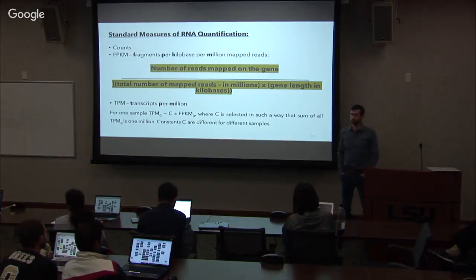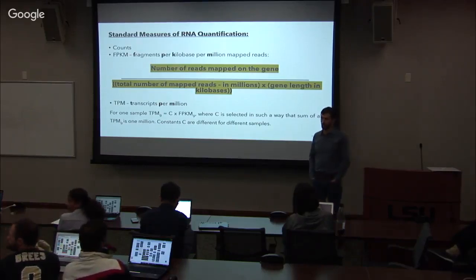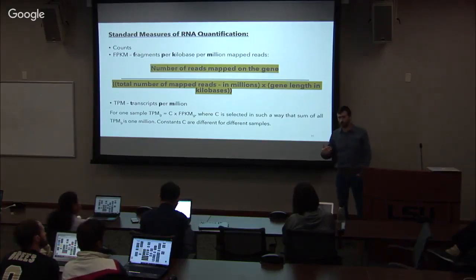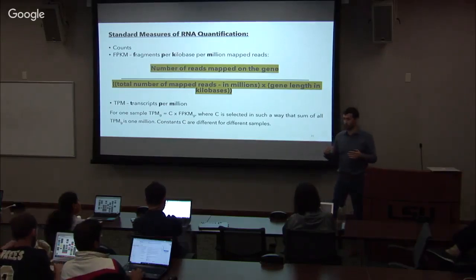I have a question. Does paired-end reads have an advantage over single-end? Yeah, they do. So the idea is that the sequencers have a certain rate of error. And so when you do the same thing from different ends, it's like you do it twice.